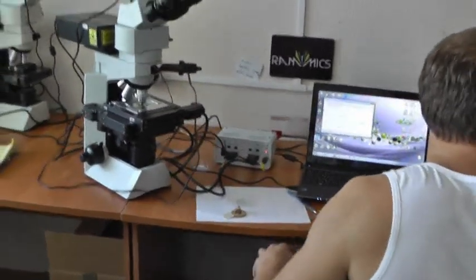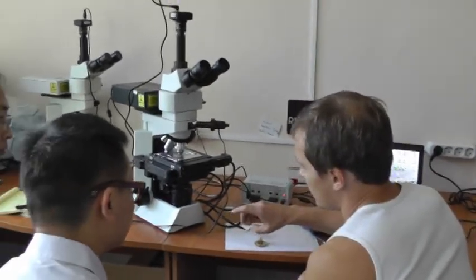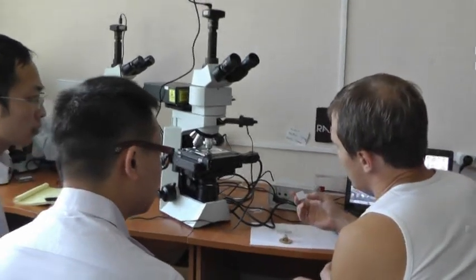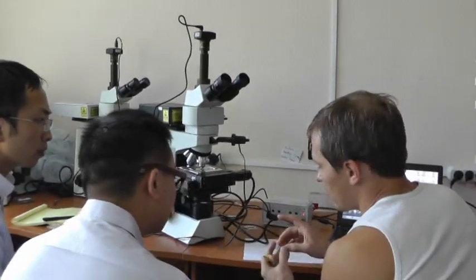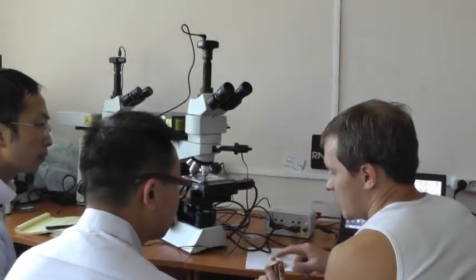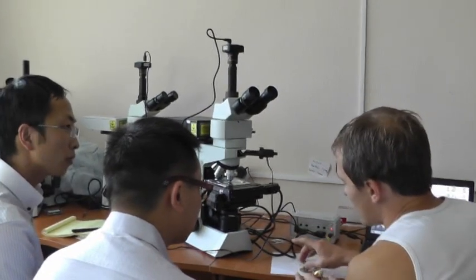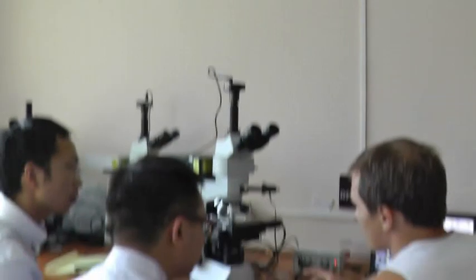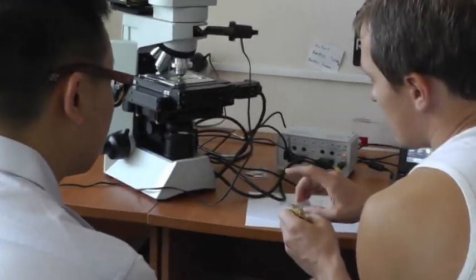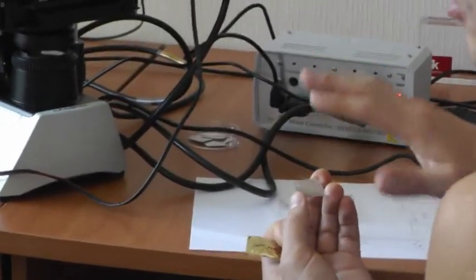It requires the powder to be applied on a flat reflecting surface, like glass substrates covered by aluminium foil, aluminium tape, or anything like this. It could be just a flat metal surface, but the cheapest and easiest solution is glass covered by aluminium foil.